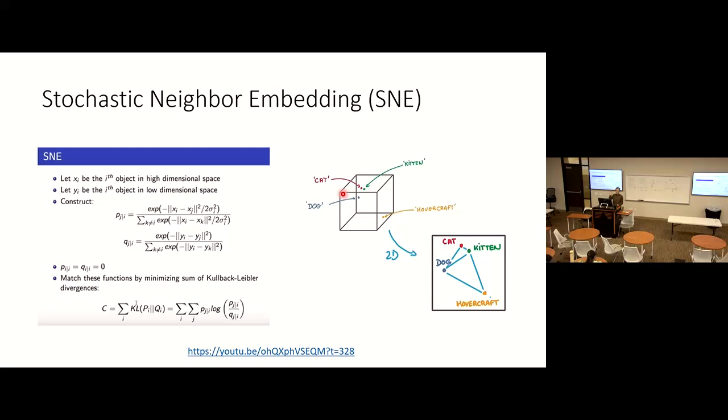So I will randomly generate the positions of these 2 cells to keep them close to each other compared to others, because these 2 are very close in the high dimensional space. On the other hand, if in the high dimensional space these 2 are far away, I want to keep that relationship when I project them into 2D.